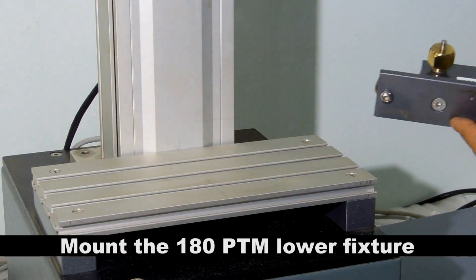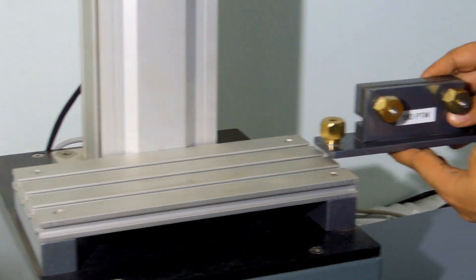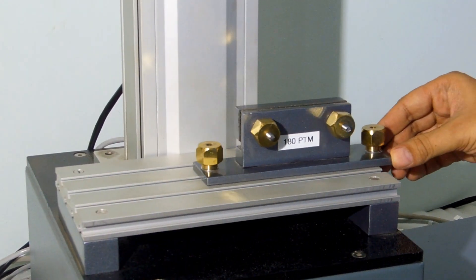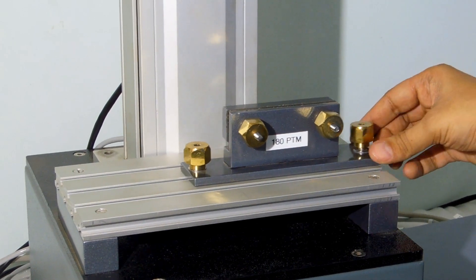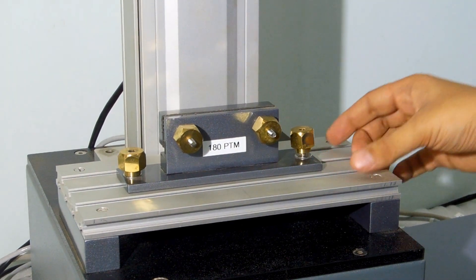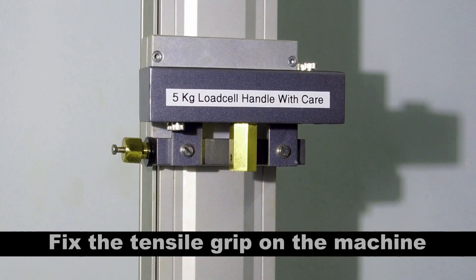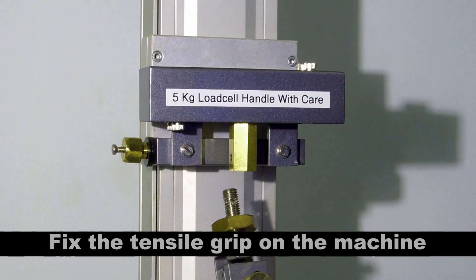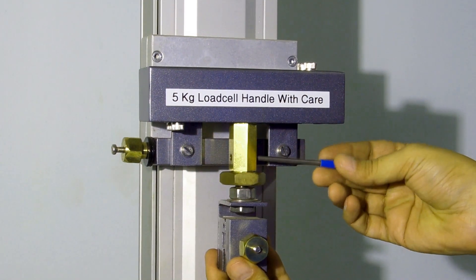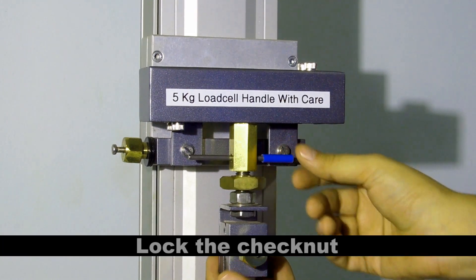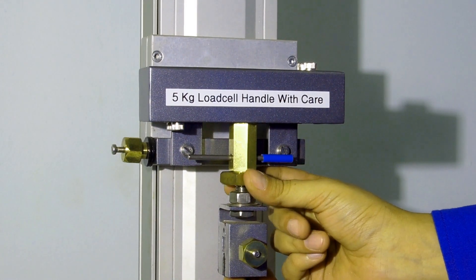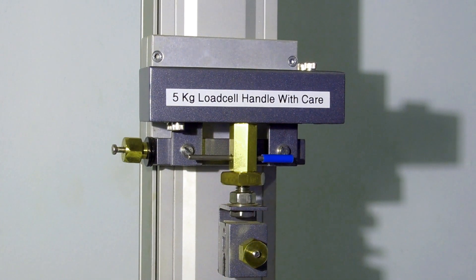Mount the 180 degree peel test lower fixture on the machine. Fix the tensile grip on the machine. Lock the check nut. Switch the controller on using the red switch present at the back side of the controller.